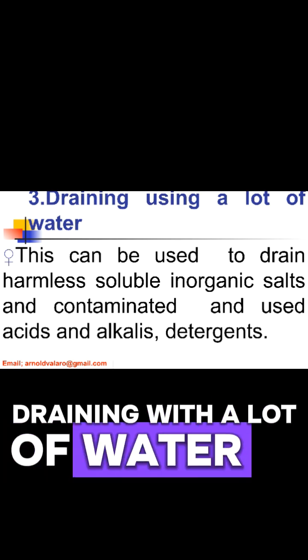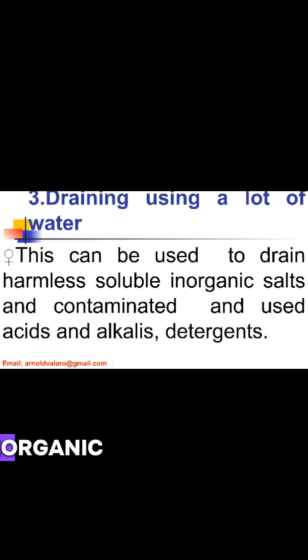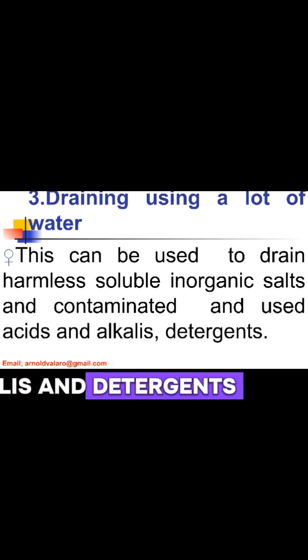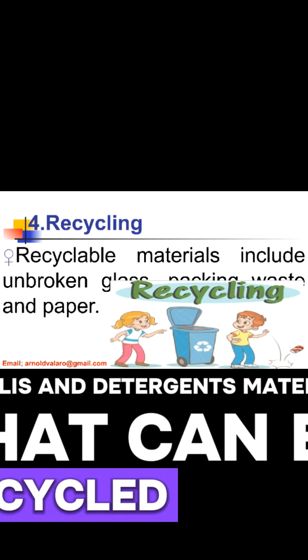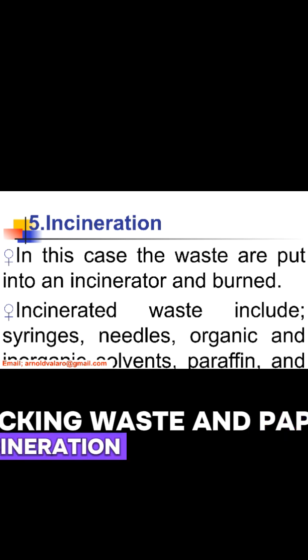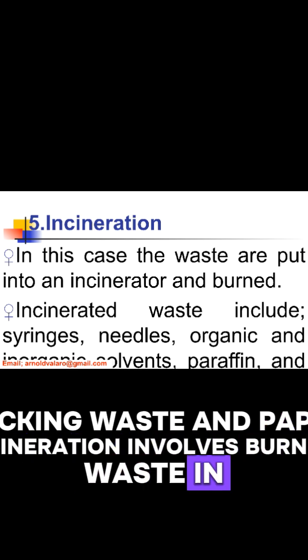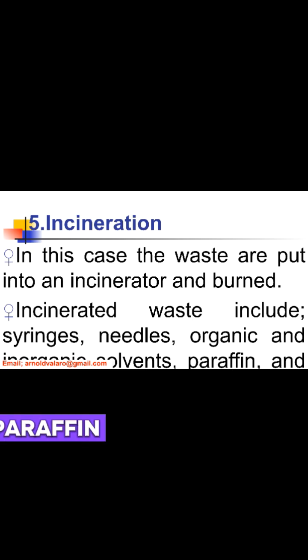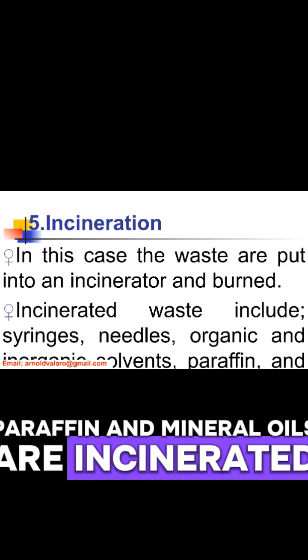Draining with a lot of water is suitable for harmless soluble inorganic salts, contaminated acids, alkalis, and detergents. Materials that can be recycled include unbroken glass, packing waste, and paper. Incineration involves burning waste in an incinerator. Wastes like syringes, needles, organic and inorganic solvents, paraffin, and mineral oils are incinerated.